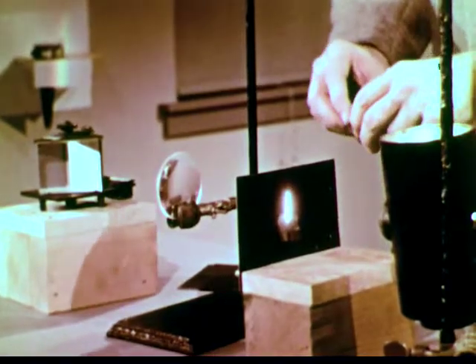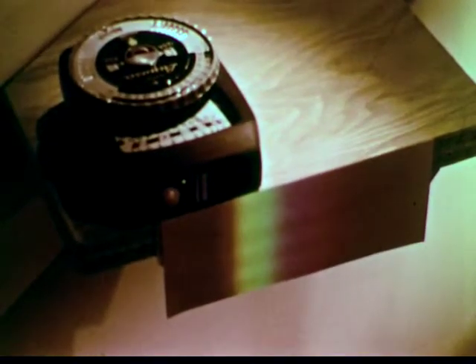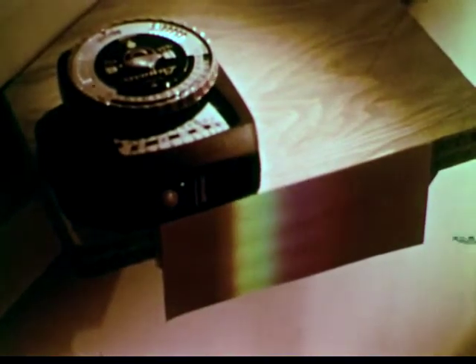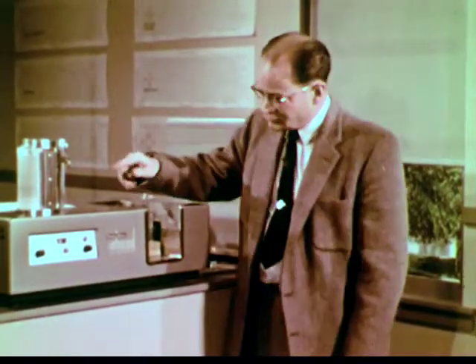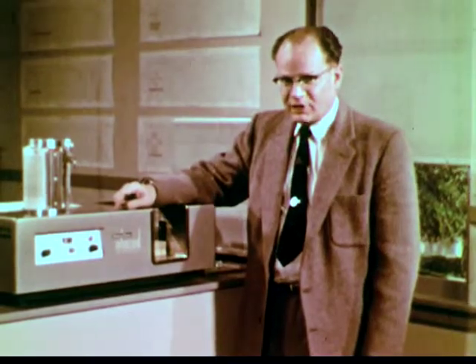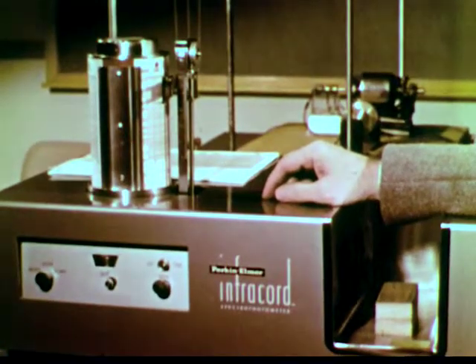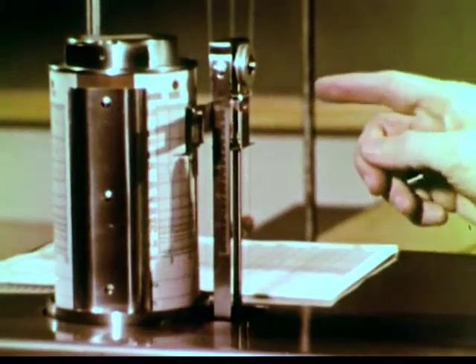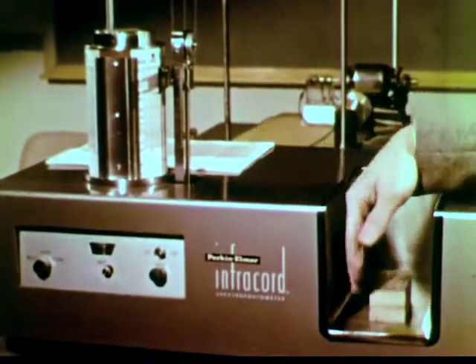Now let's see how molecules will affect the spectrum. This solution of copper sulfate absorbs in the red region, transmitting the blue. Different materials absorb the various colors of the visible spectrum at different frequencies. Here, we have a spectrometer which scans the infrared spectrum and draws a graph of the transmission of the sample in the infrared. In this spectrometer, the instrument runs through frequencies in the infrared range, around 10 to the 13th cycles per second. The top of the chart corresponds to 100% transmission, the bottom to 0 transmission.